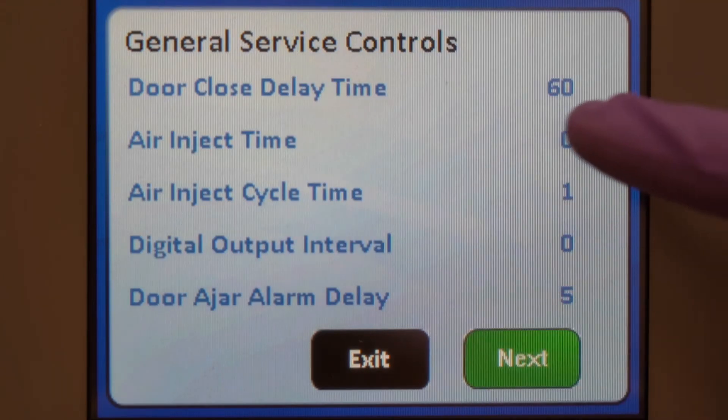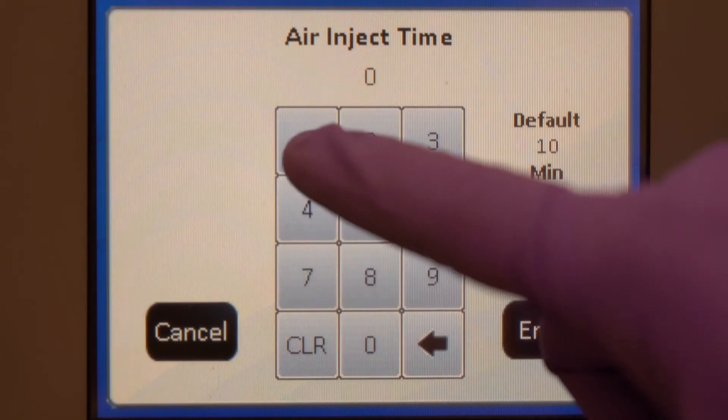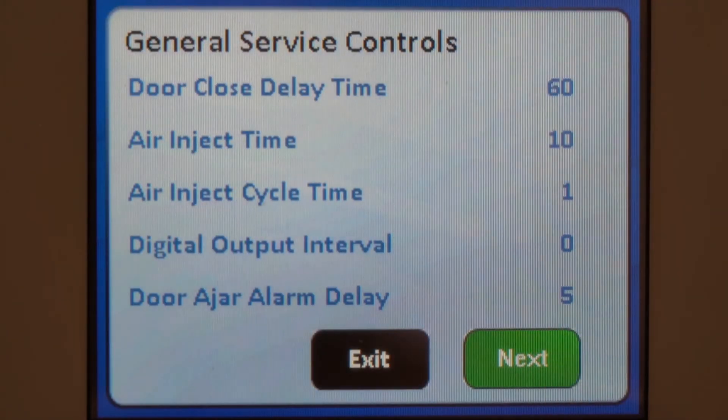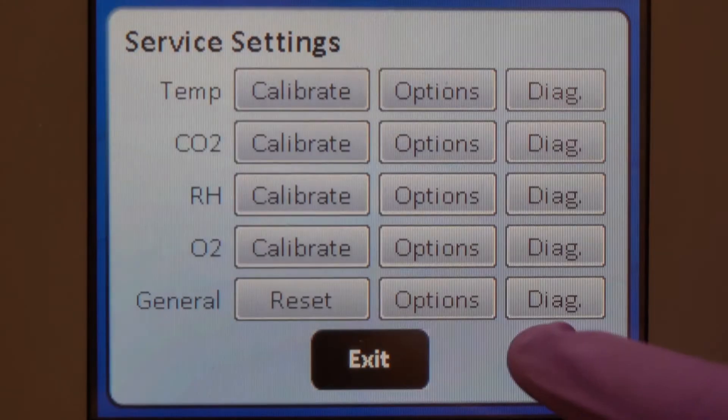Reset the air injections to their previous value. Remember to save when you're done.